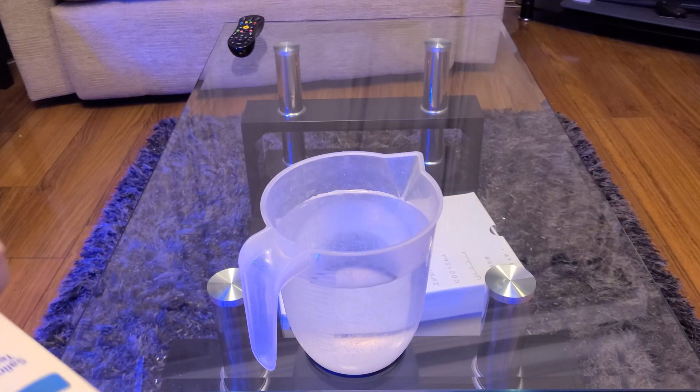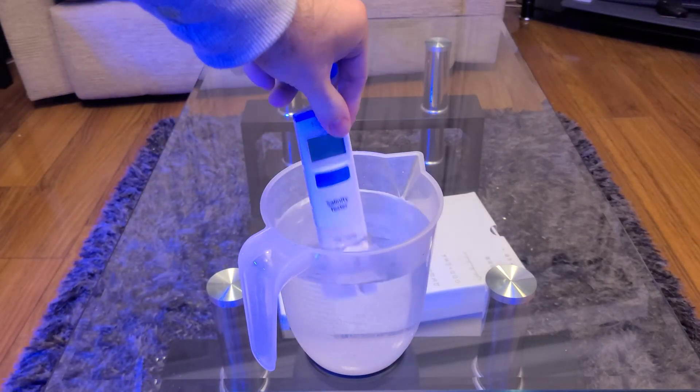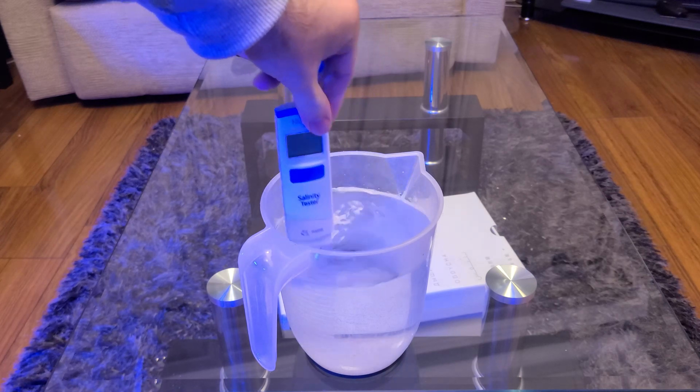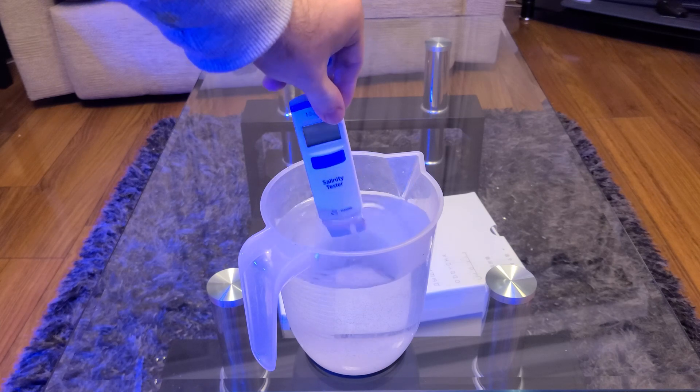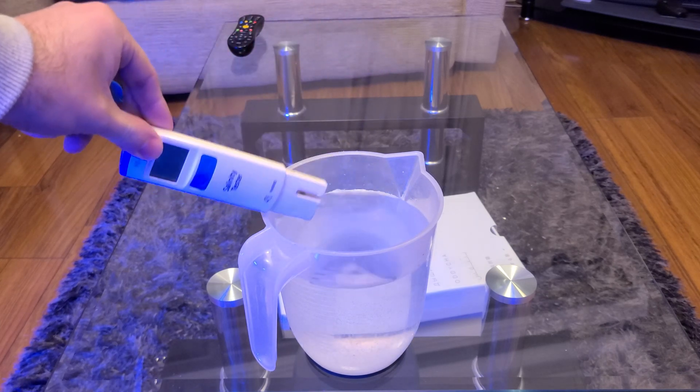So the first thing I do is thoroughly rinse the salinity checker in RO water. This removes any salt residue from the device, which could potentially pollute the calibration fluid and affect the accuracy of your calibration.